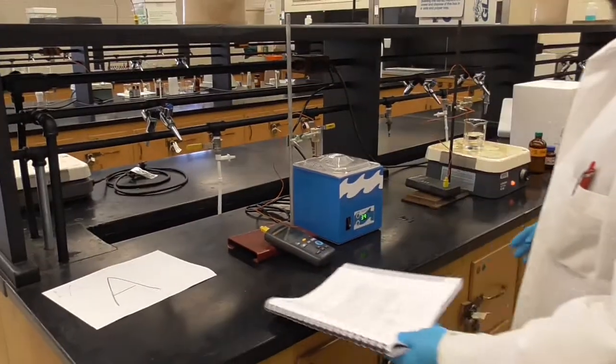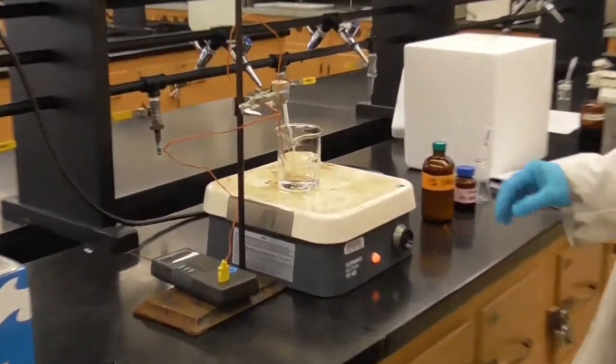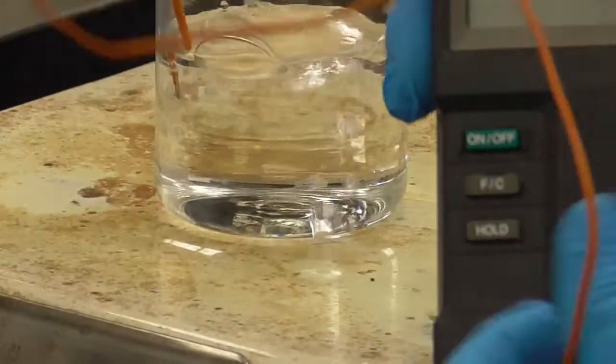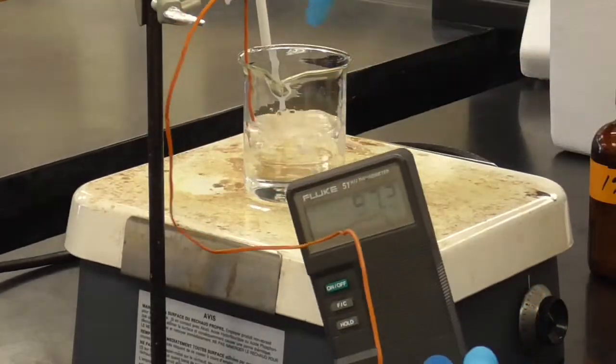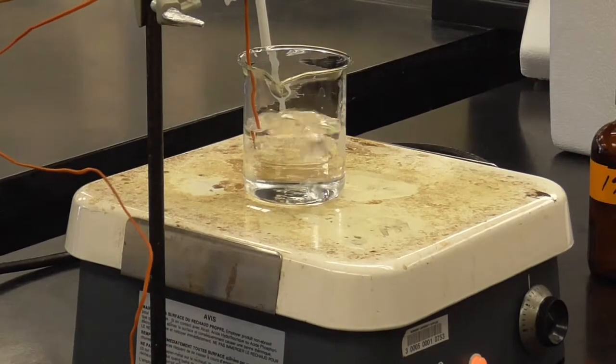Next, we have our boiling water bath. Obviously, way hotter than inside the human body. Right? 97 is what we're recording there. We've got the probe down in that bath, and so just shy of 100, and it's boiling.